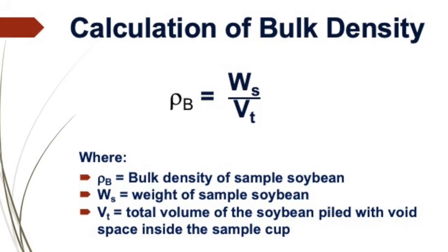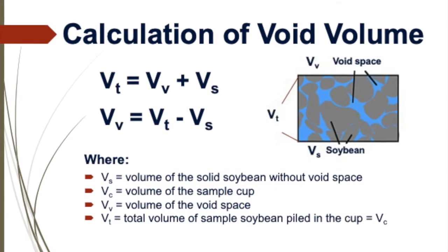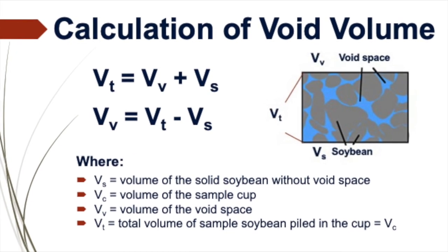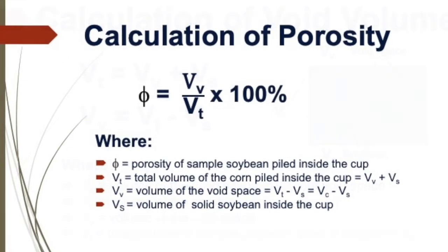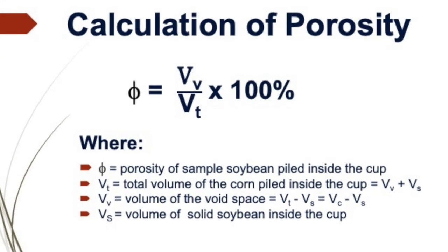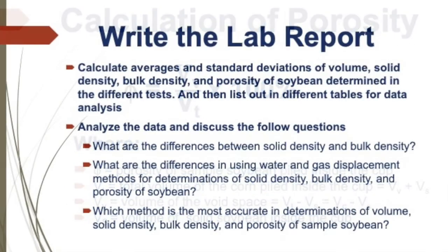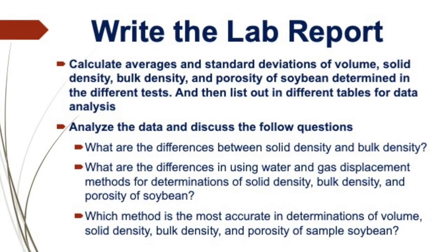Calculate the bulk density of the soybean. Calculate void volume of the soybean inside the cup. And then calculate porosity of the soybean. Eventually, write the lab report.